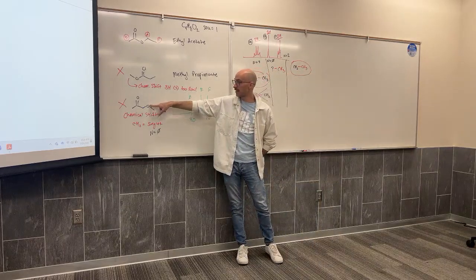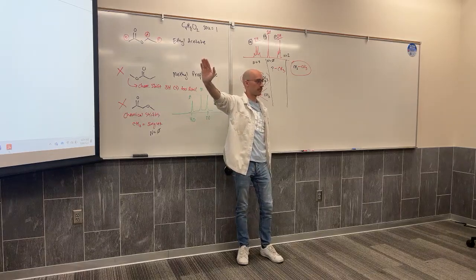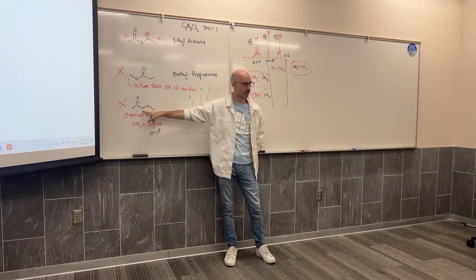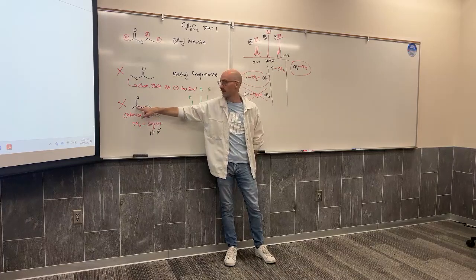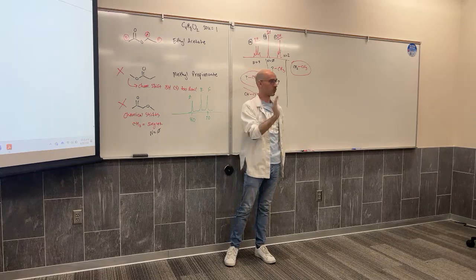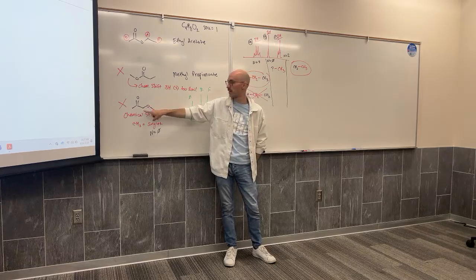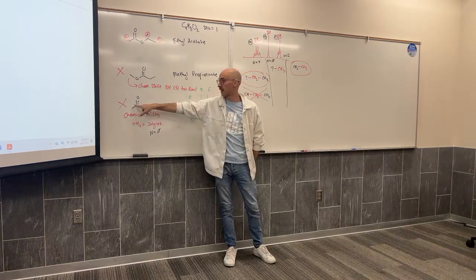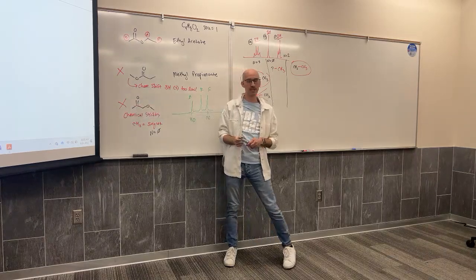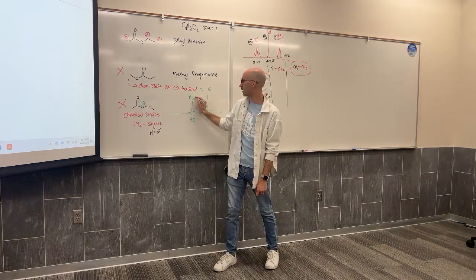So this CH3 is functional group adjacent, so I would expect it to be a little bit further to the left of my functional group range. But what about this one? Isn't that also adjacent to the same functional group, plus adjacent to this functional group? It's that compounding effect that the chemical shifts have. This CH2 is being pushed left by the deshielding of this functional group. It's also being pushed left by the deshielding from the carbonyl functional group. Does that make sense? Multiple groups adjacent to it, compounding effect. A integrates to 2H.